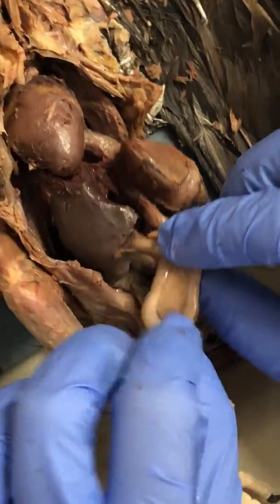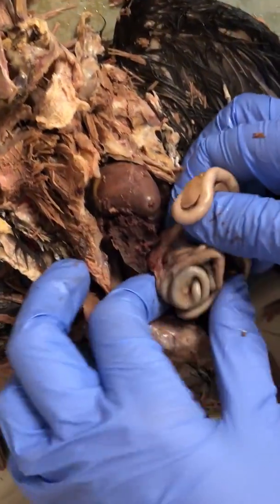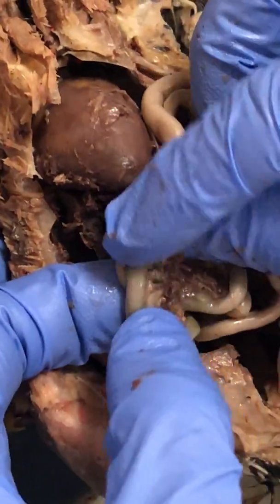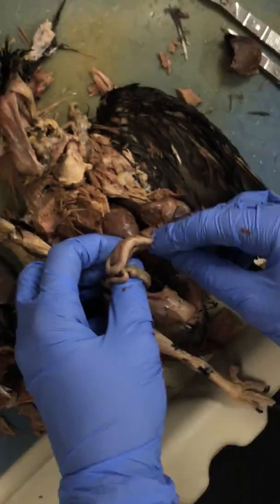The duodenum is the first part, and then we have the pancreas, which leads into the small intestines. If we remove the other part of the liver, we can see all of this — the small intestines connected by mesentery, which is all this tissue in between. It's highly vascular so that nutrients absorbed from food can travel through it.